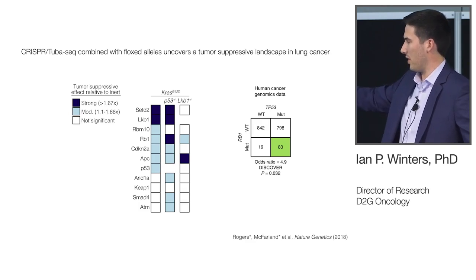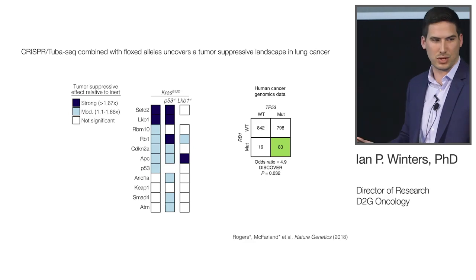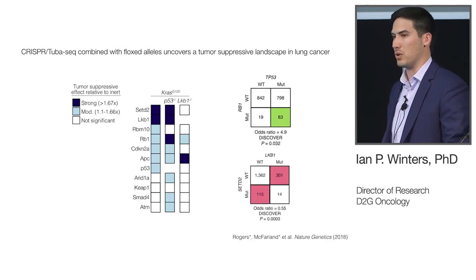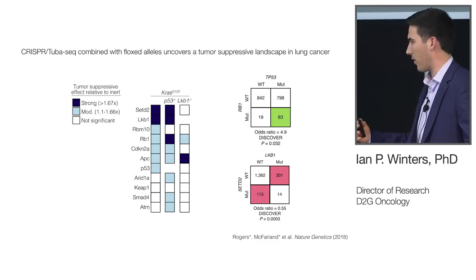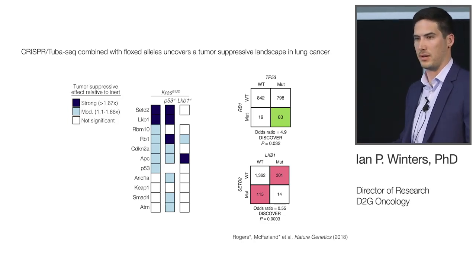But when you combine them, LKB1 deficiency plus SETD2 inactivation, there's no added benefit, suggesting perhaps that these 2 genes are in the same pathway or doing something redundant. So what you'd expect in humans is that these would be mutually exclusive, since adding that second alteration adds no benefit, and that's indeed true. We see that it's preferentially mutually exclusive in the human data. And actually, if you take this entire grid and correlate it with human data, it does align pretty well.